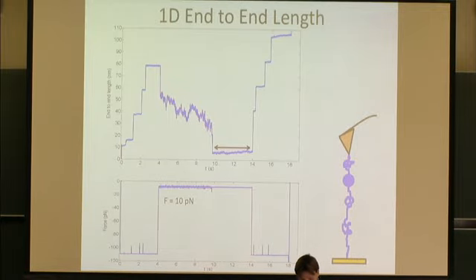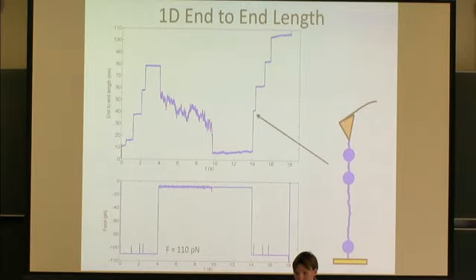So this is really why we can't identify which one is unfolding and which is refolding. Is this right picture realistic? No, we don't know which one is which. We only know the end-to-end length. We don't know.